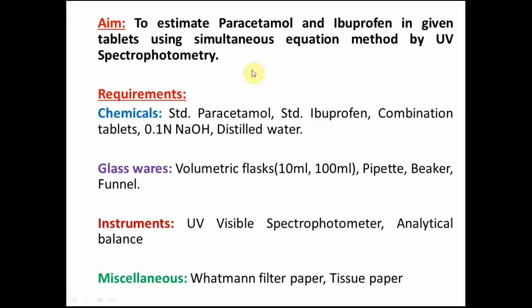Hello friends, today we are going to discuss the practical, that is the simultaneous equation method. Today's aim is to estimate paracetamol and ibuprofen in given tablets using the simultaneous equation method by UV spectrophotometry.